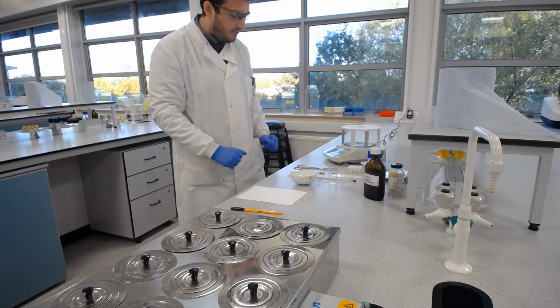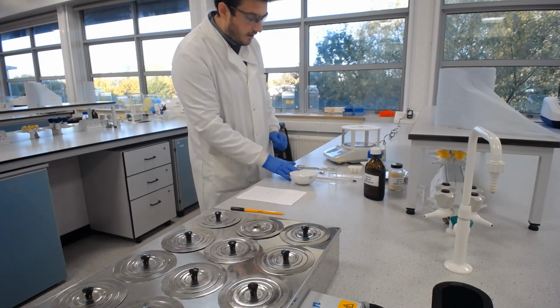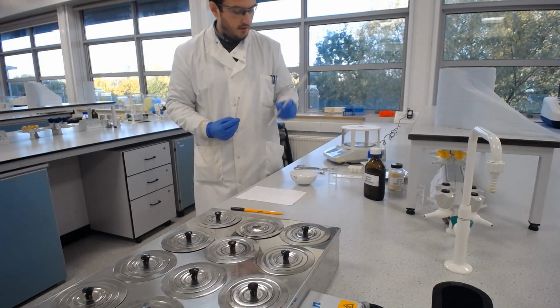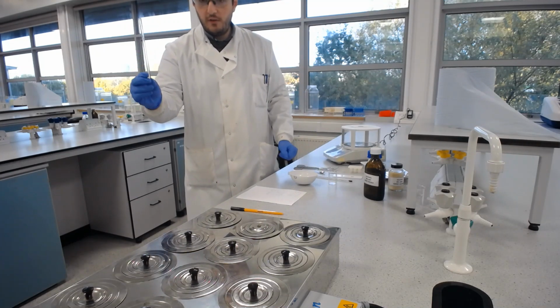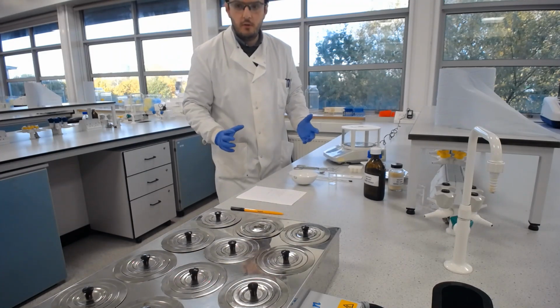And we've got a collection of other tools that we're going to use here: some tongs, a spatula, thermometer, and a stirring rod. So remember, the thermometer isn't a stirring rod, it's delicate and you don't want to break it. A stirring rod is a stirring rod, less delicate, and it doesn't really matter if you break it. We don't want you to, but it's not as big a deal.